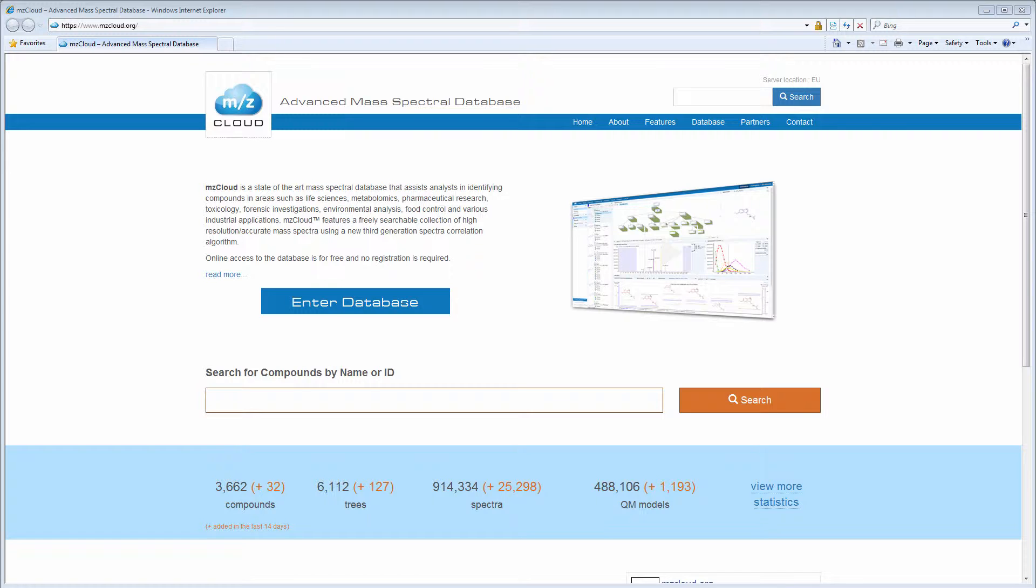Spectra are of the highest quality, being filtered, manually recalibrated, and annotated by fragments processed by knowledge-based and quantum chemical methods. In this video, we will give an overview of the basic MZCloud features.